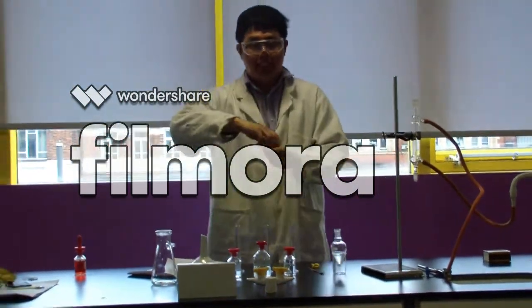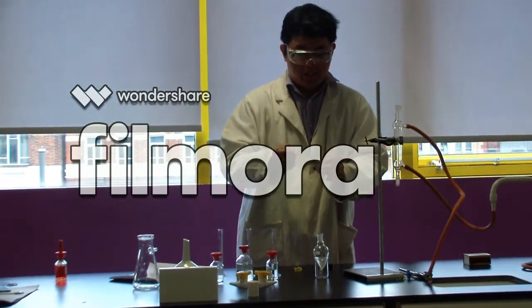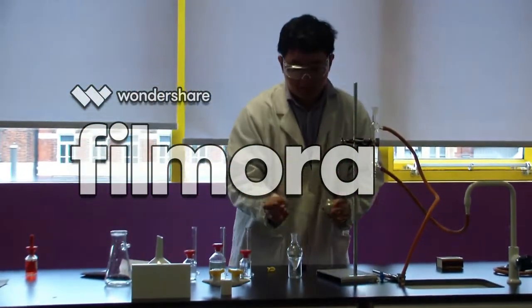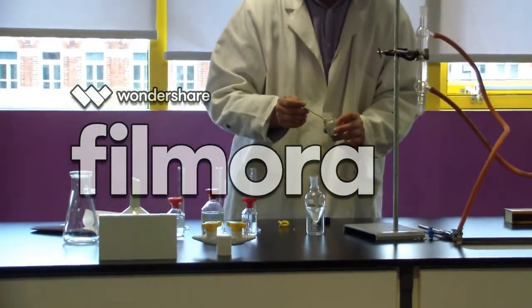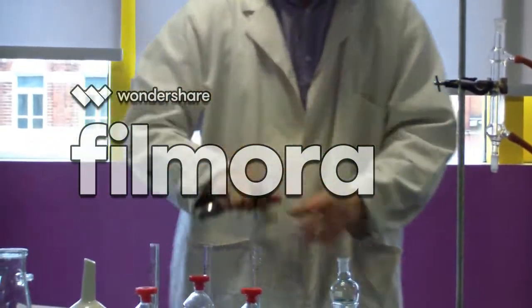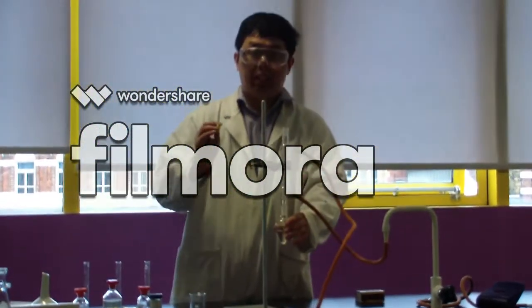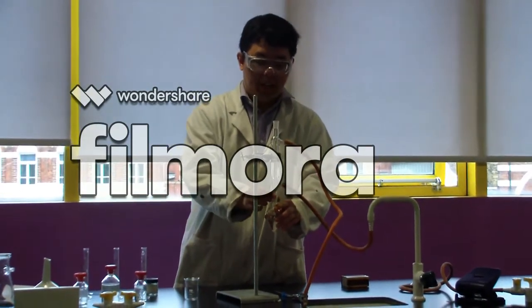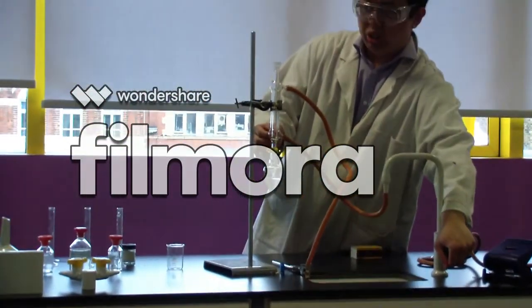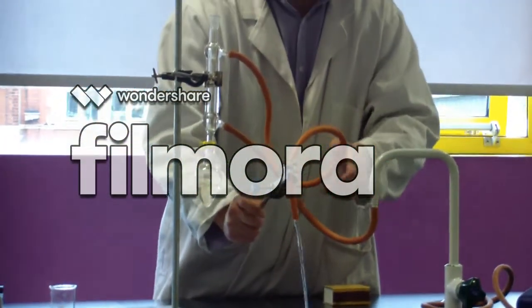I put a few anti-bumping granules into the solution in order to stop it bumping whilst I'm refluxing. Now I will place this onto the condenser. You can use a clip or you don't need to, but I would like to use it. And then we turn on the condenser. You can see the water goes from the bottom to the top. A nice easy stream.